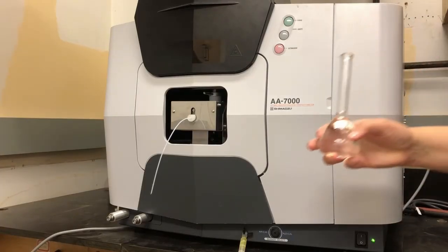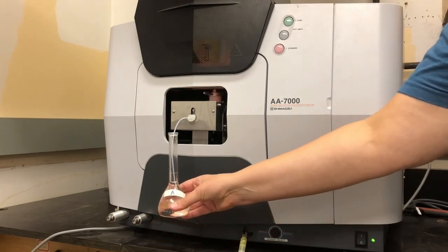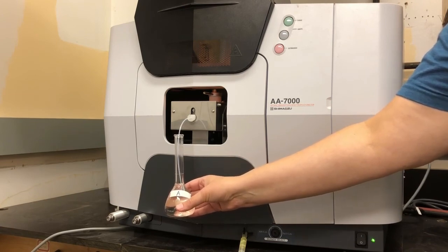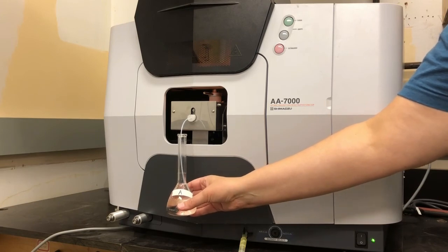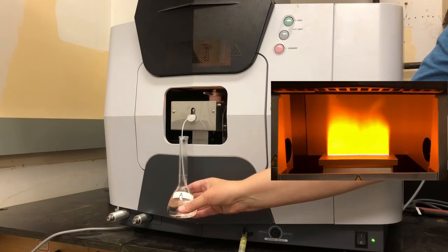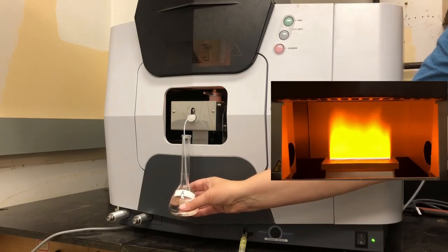Okay, so let's start our sample. We have sample A, the first replicate. We put that on, so I'm just holding it under the sample tube gently, so that it's taken up into the sample tube. You should be able to see the color change in the flame as the iron is entering the flame. We press start on our machine, and then we wait for the readout.